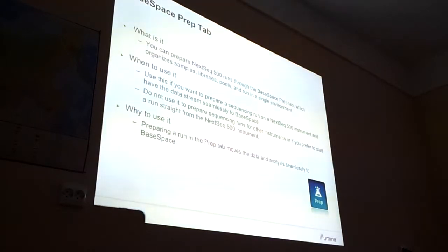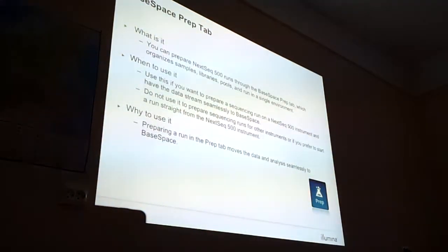So in BaseSpace, you have a special tab. So a tab is something like this. Yeah, this is a tab. It's the same as on your mobile phone. You have these tabs. Yeah, so these are all tabs.